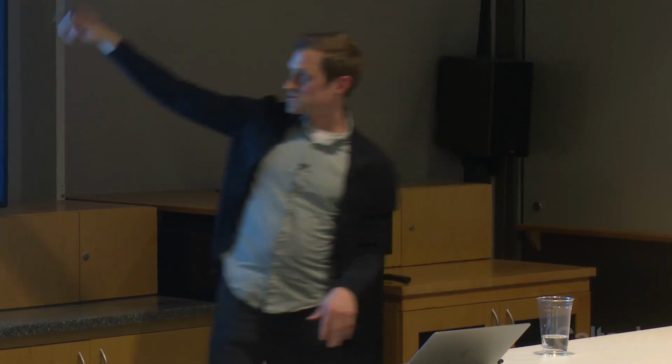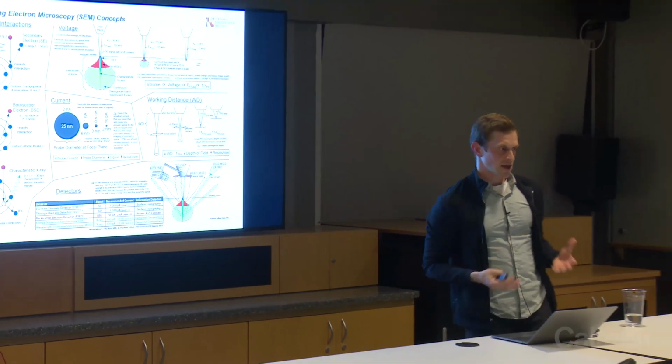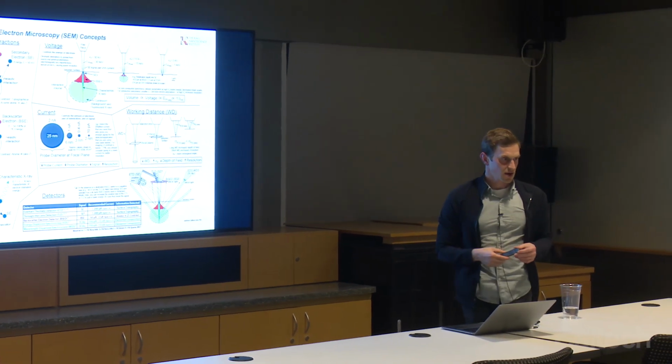Okay. Questions? So I know I just hit you all with a hammer for like an hour. And truthfully, I designed this presentation so that when people ask me questions, I send them a couple of slides. When you download the slides, they have slide notes attached to them. So if you had a question about environmental SEM, I'd send you the 3 slides on that and you can read about it. This is just meant to be a resource for you all to download and use, depending on what type of microscopy you're using. But I think it's important to understand these physical concepts, and that's why we spend a lot of time going through this. Because if you can understand what's going on on this one piece of paper, then that's about 95% of the game in terms of being able to optimize your microscopy to get the best results in an SEM.